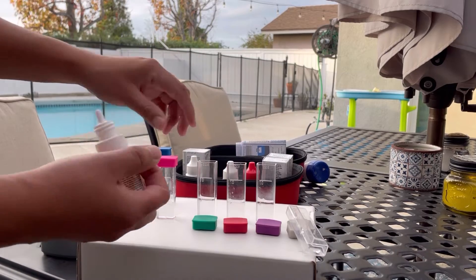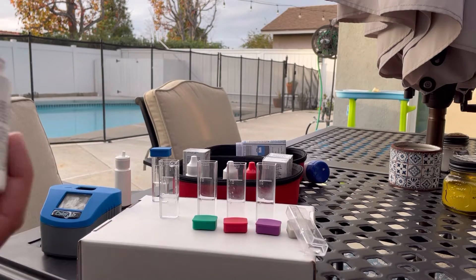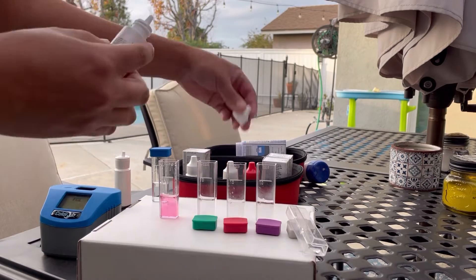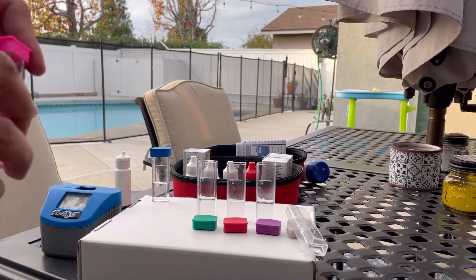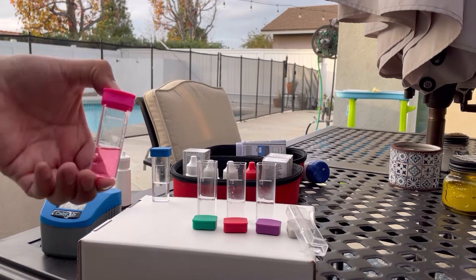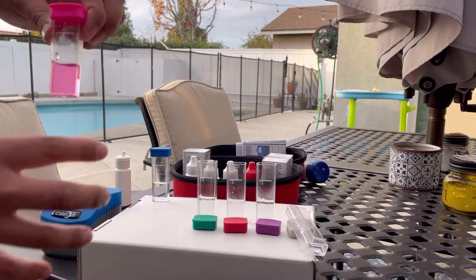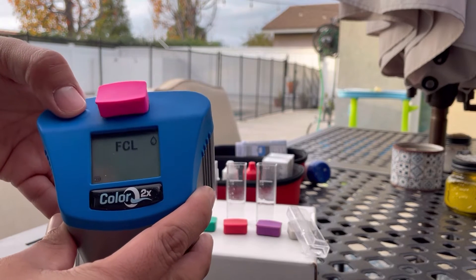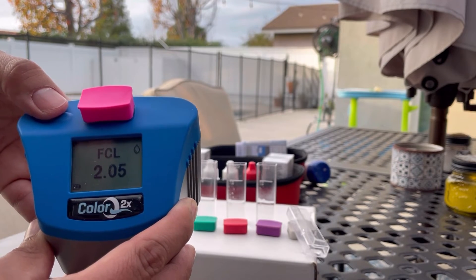Then we're going to add five drops of DPD1b. Once we've got that added, before inserting into the unit, I'm going to put the cap back on, invert it, and flick it a couple times to get rid of those bubbles. Once the bubbles are gone, I'm going to insert it in the unit itself, click this button here, and we should get our free chlorine results — which is at 2.05. It's a little low, telling me I'll most likely need to add a little bit of chlorine.